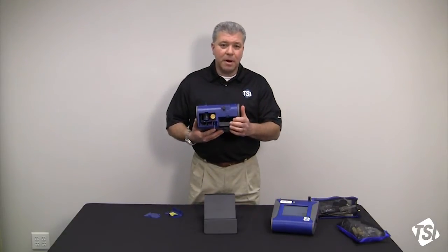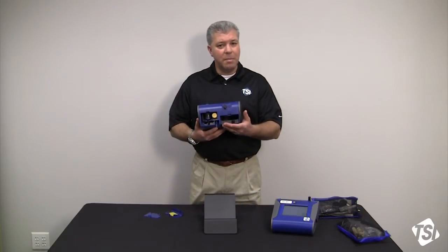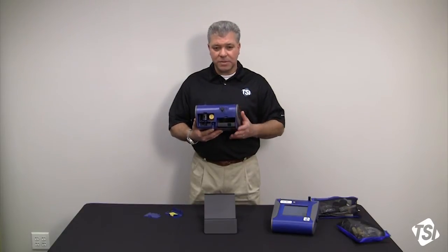The battery compartment will house two batteries. Each DustTrak comes with one battery, but if you'd like a second battery to extend sampling run times, you can certainly purchase another one as an accessory.